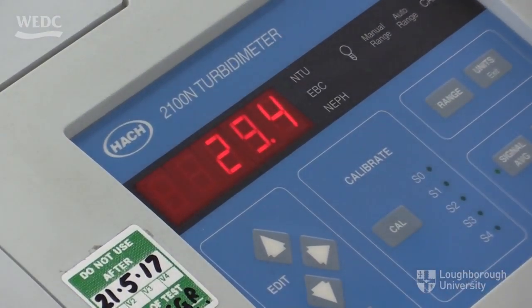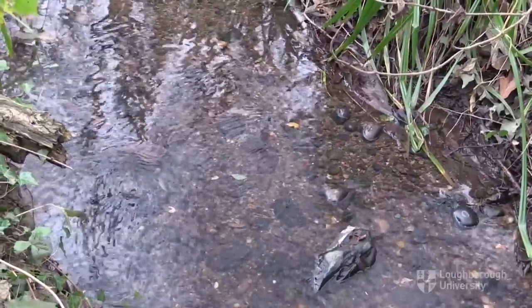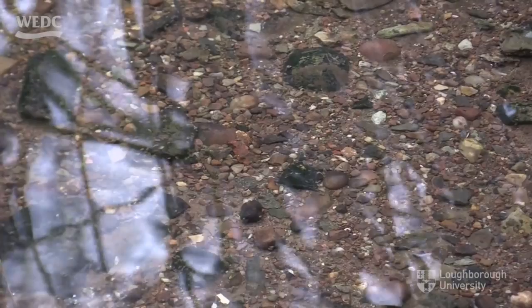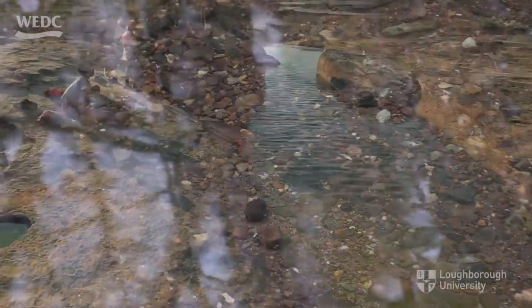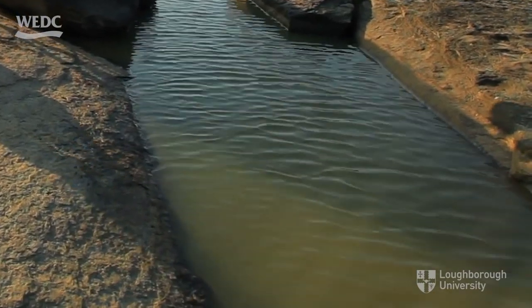In this example, it records a reading of 29.4 NTU, which is reasonably clear. Water with a reading less than about 30 NTU could be treated by filtration without causing too many problems. Water having a turbidity of more than about 30 NTU can cause filters to clog.